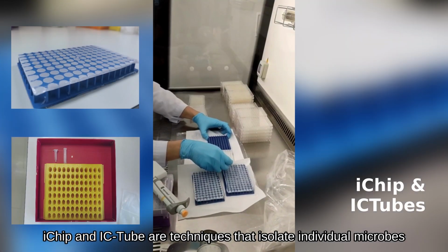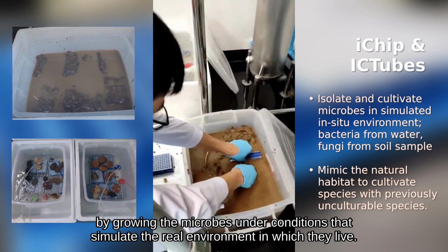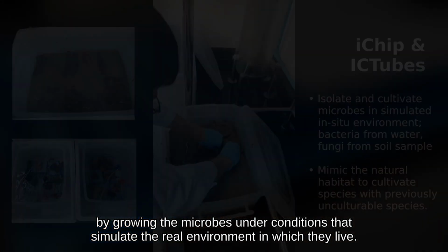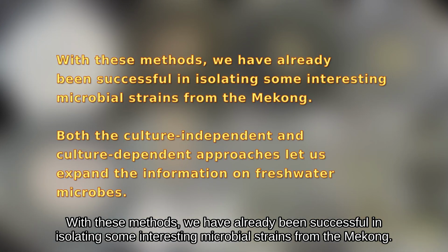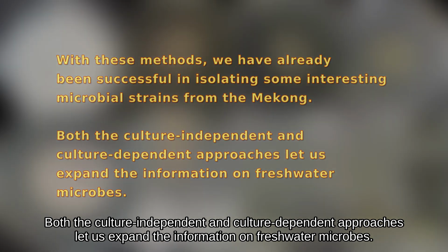iChip and IC-tube are techniques that isolate individual microbes by growing the microbes under conditions that simulate the real environment in which they live. With these methods, we have already been successful in isolating some interesting microbial strains from the Mekong. Both the culture-independent and culture-dependent approaches let us expand the information on freshwater microbes.